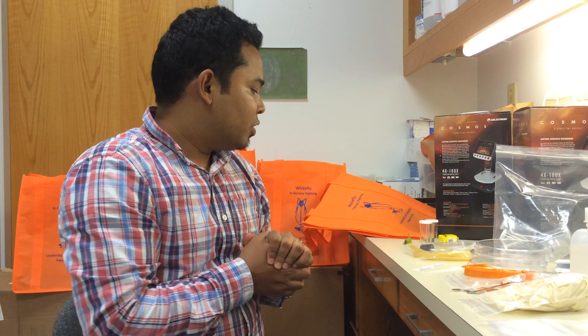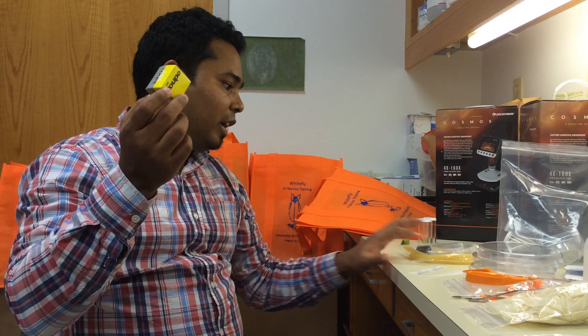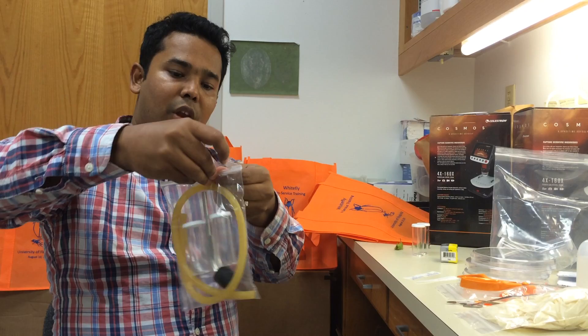The first three items, which will be used outside in the field, include a hand lens — this is a 10x hand lens provided in the kit — and an aspirator. Inside the kit you will find the aspirator in a zip lock bag. You can open the zip lock bag and take the aspirator out.